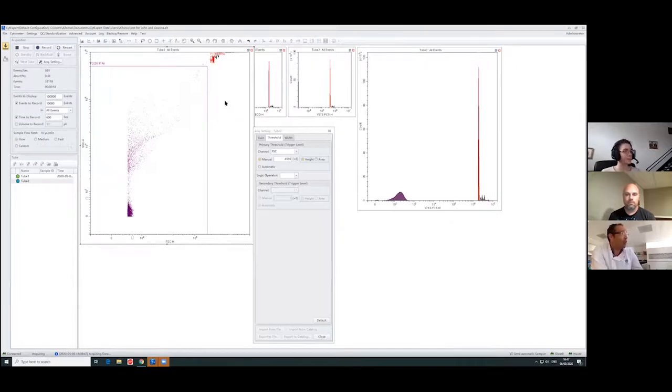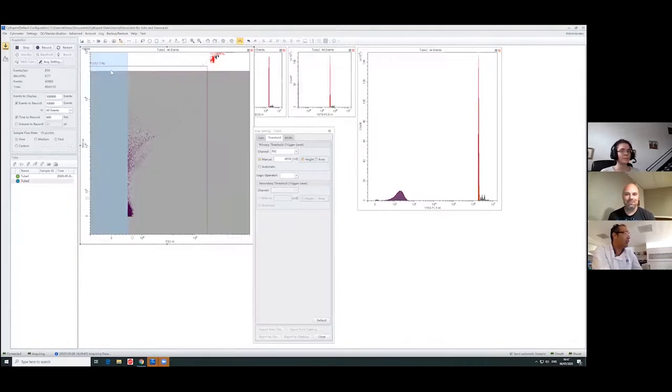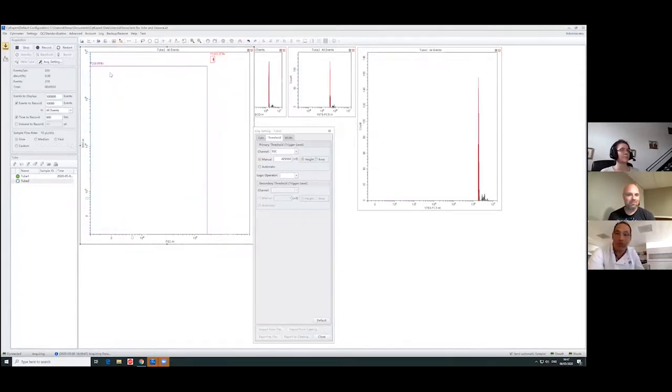The other thing that is important here is, John was mentioning the side scatter. So we will see again that we have the forward scatter threshold here. We can right click and say we want to use side scatter now. In fact, the side scatter threshold is one of the ones that we use for bacteria. So the result at the end is the same. And again, we can start to play and drop down the side scatter threshold as low as we want. Okay, so this is another option.